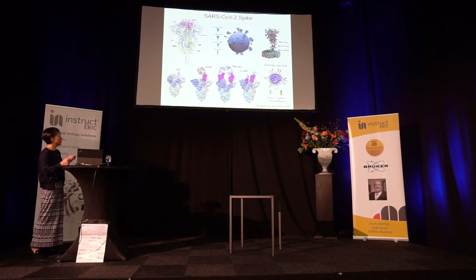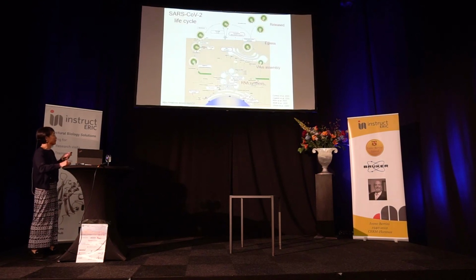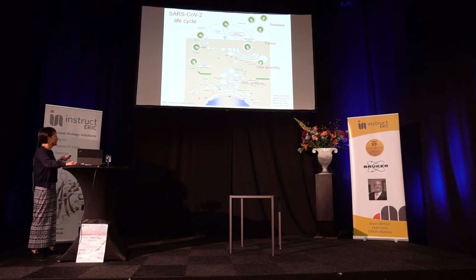Now, we were wondering what's going on, what does the virus really look like inside as it's just being assembled and budded off. So we decided to do in-cell, in-situ structure analysis of the infection process. We are focusing on the latest stage of infection, 24 hours post-infection, and we study RNA synthesis, virus assembly, egress, and the released sample. But today I will focus on the spike part of it as it assembles in this site.